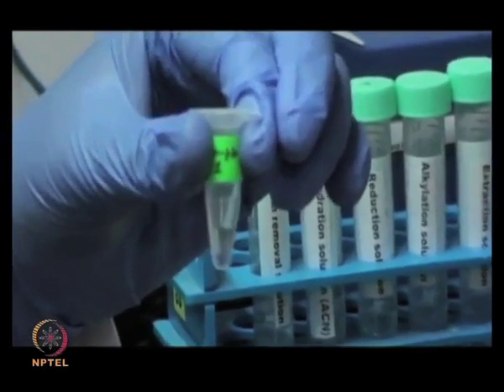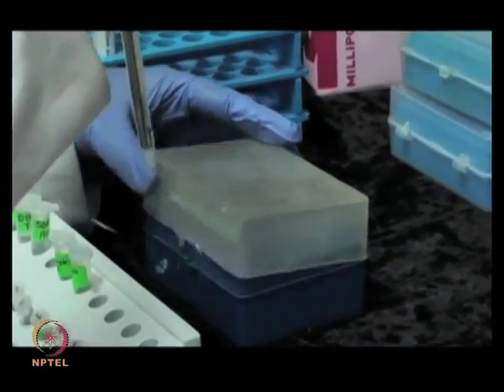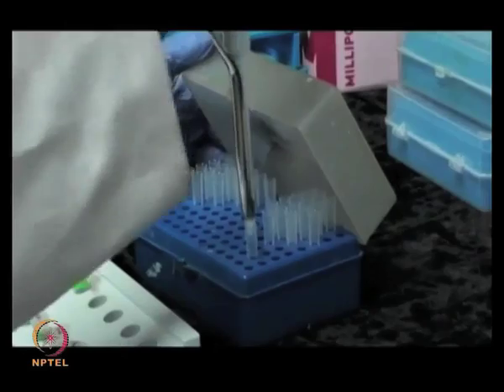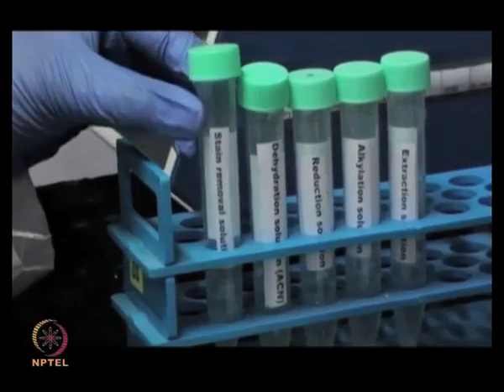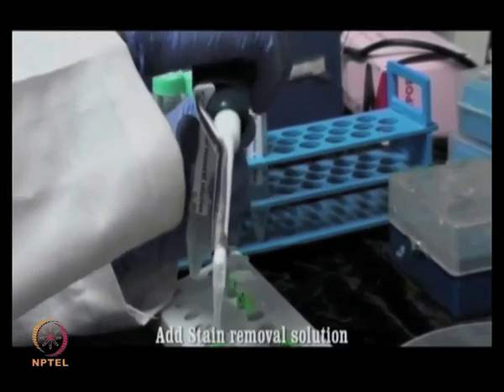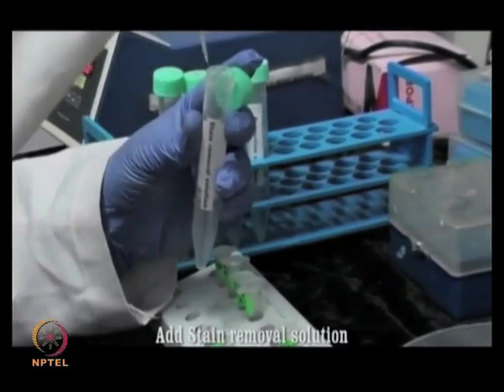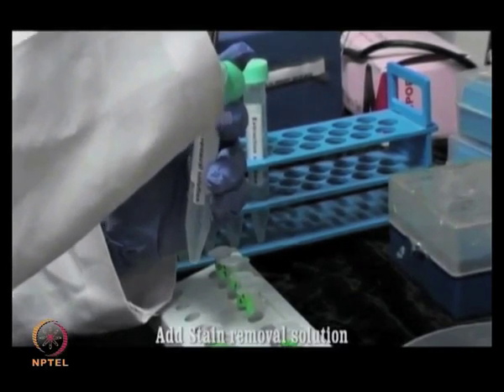Now, you can add 50 to 100 microliters of stain removal solution. For large gel pieces, take enough liquid to cover them completely. So, you can adjust the volume depending on the size of your spots or the band.